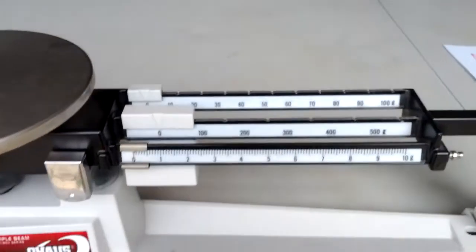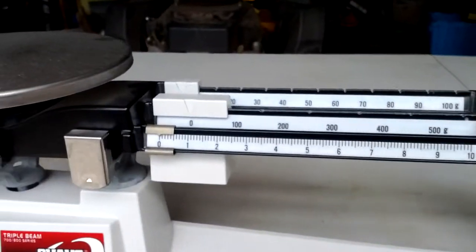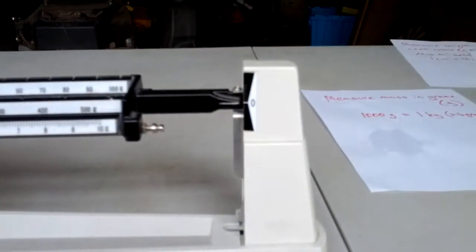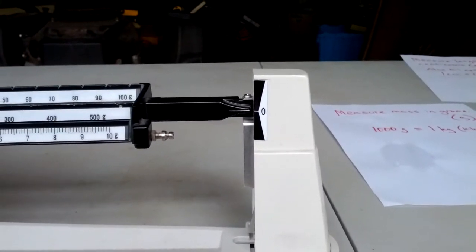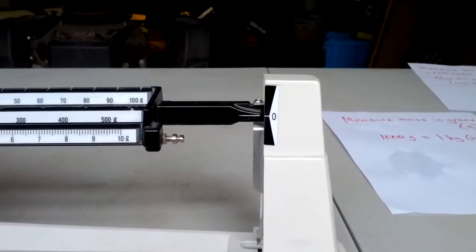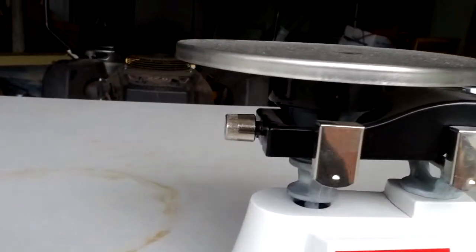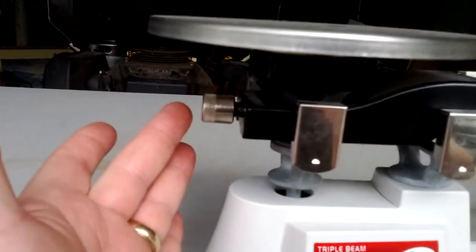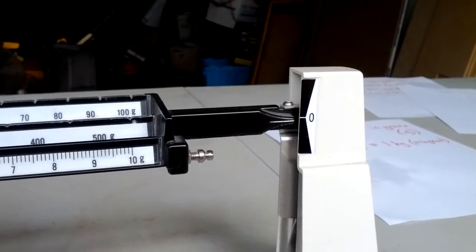So we're going to see if it's zeroed. All the riders have to be on zero. And if they are, then the little mark over here should be right at the zero mark on the scale. And it is. If it is not, you can adjust it. There's a little screw on the end here that you can adjust to make sure that it's right on zero. But this one is on zero, so we are not going to mess with it.